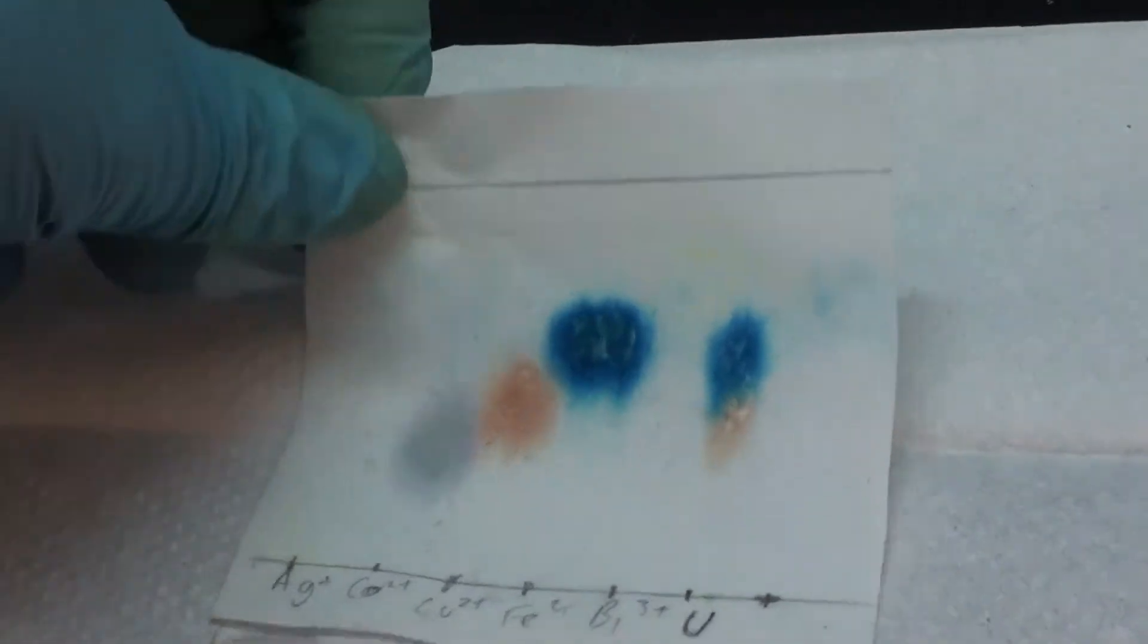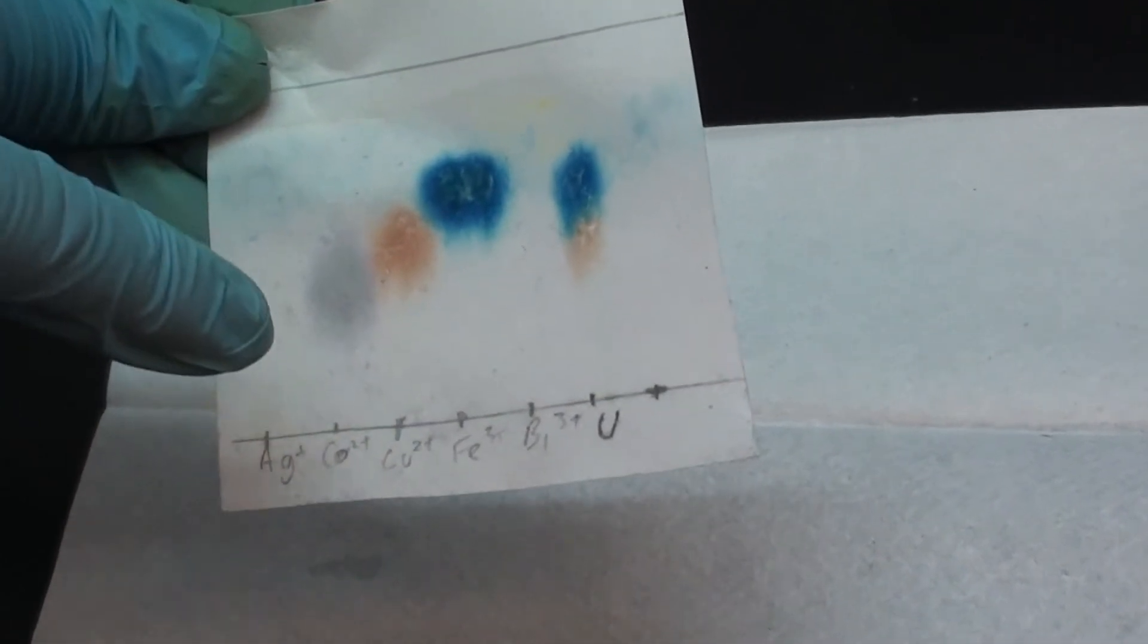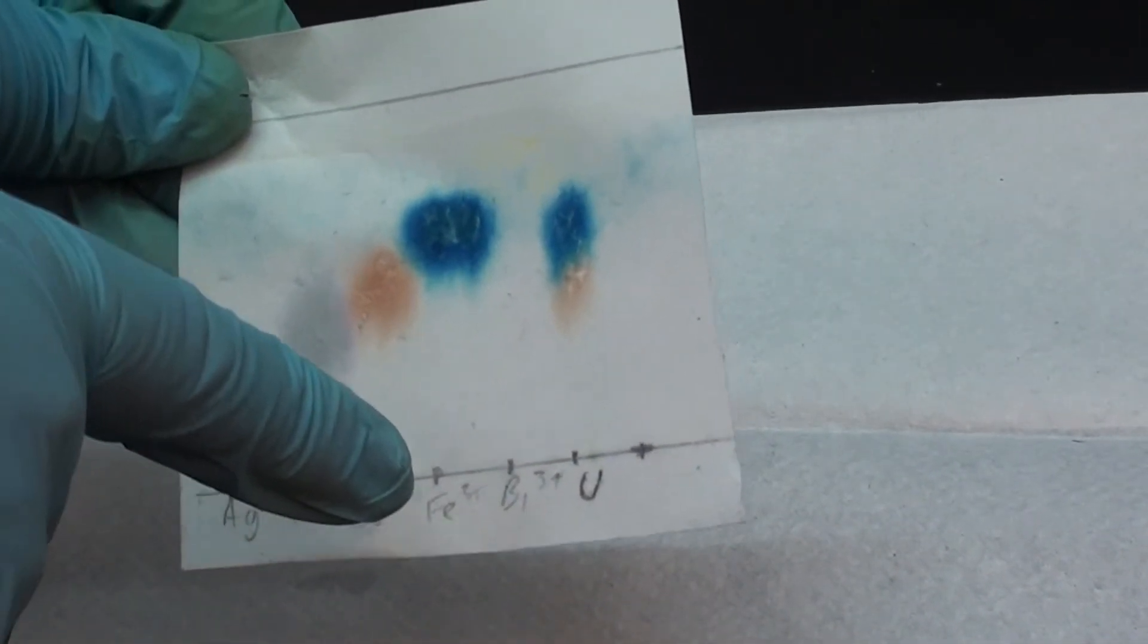So as you can see from this one, if I had to guess what was in the unknown, I'd say this one here, which I guess is the copper 2+. Then you've got the iron here and I can see both of those in the unknown. That's what I would reckon is probably in the unknown after I go ahead and stain this. Alright, so that's it for that.